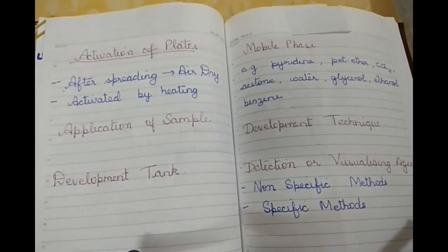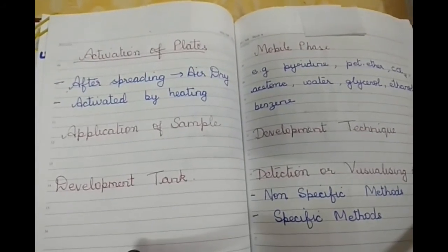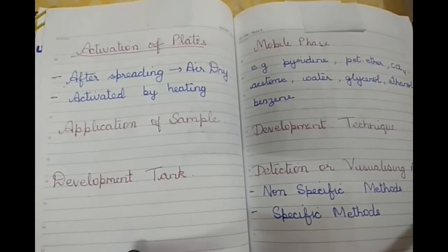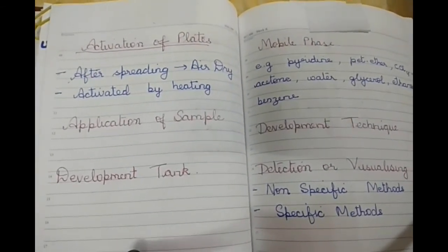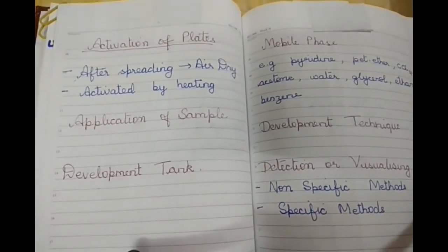Now how is the activation of plates done? First, after spreading, it is air dried for 5 to 10 minutes. Then it is activated by heating at about 100 degrees centigrade for 30 minutes. Then the plates may be kept in a desiccator.